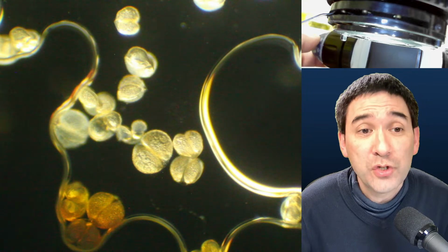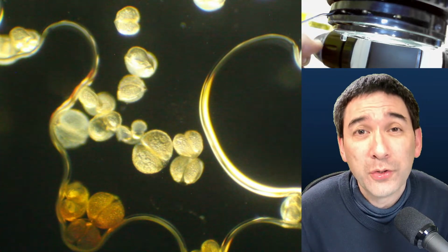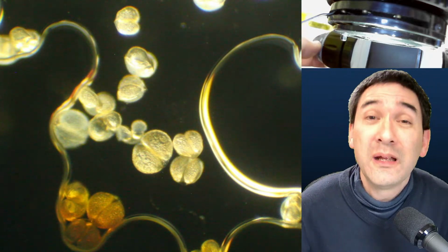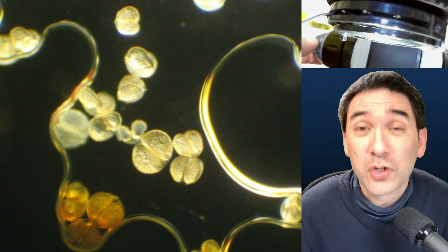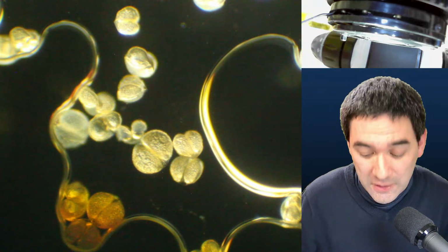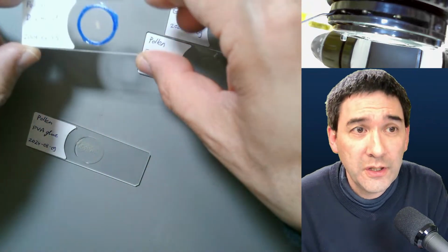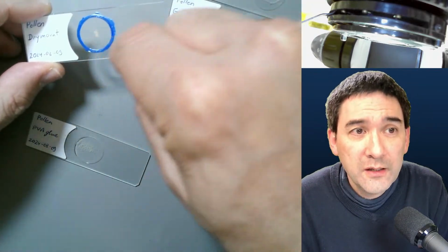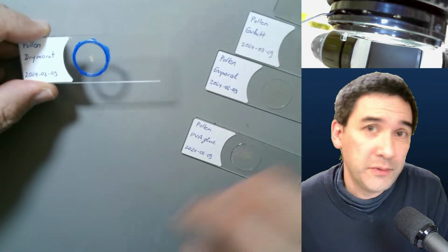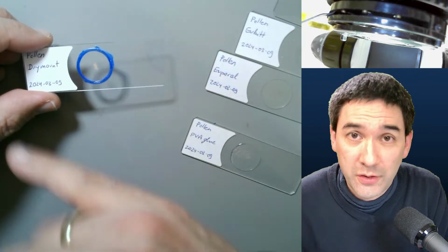Interesting. So what I would suggest is the following. If you put a mounting medium on crystals, then the liquid in the mounting medium, depending on the crystal, the solvent might actually dissolve the crystals. So what I suggest is that you actually make a dry mount. Like this over here. What you do is you make a ring using a slide ringing table, or if you watch one of my previous live streams, I showed how you can do that.